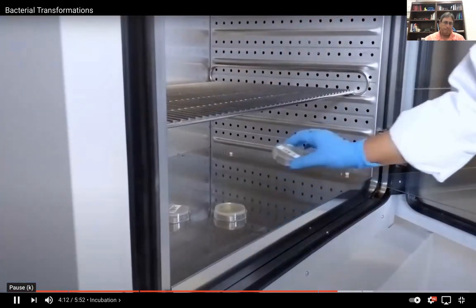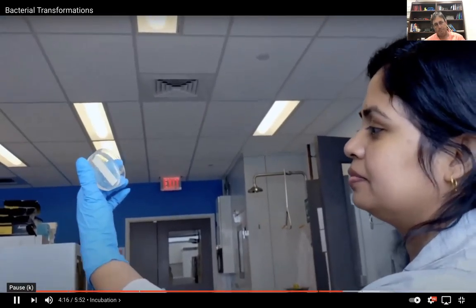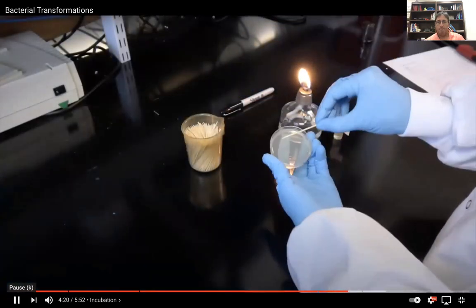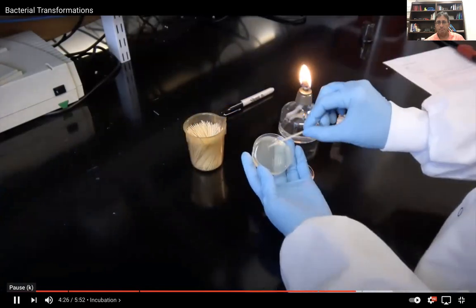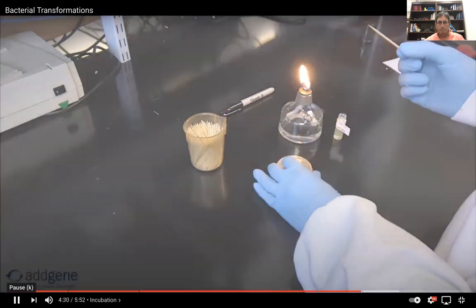After overnight incubation, inspect your plates for visible colony growth. Remember, your control plate should have no visible colonies present. If your sample plate has colonies that are too close together, you can pick a clump of cells and streak for single colonies on a new plate. See our Streaking for Single Colonies video for more information.